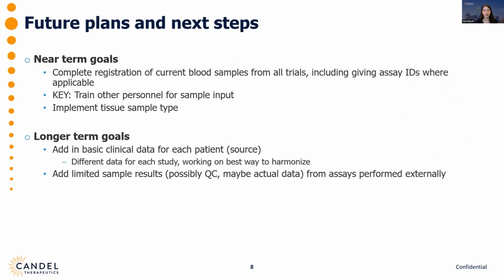I've been able to bulk register the majority of our samples that we have in-house, but we do have a bit more work to do before the implementation is totally complete. After finishing the registration of the remainder of the samples, the next step is for me to train my colleague who assists in receiving the samples on how to use the software. We'll then train some of our clinical research associates who have more interaction with the sites.